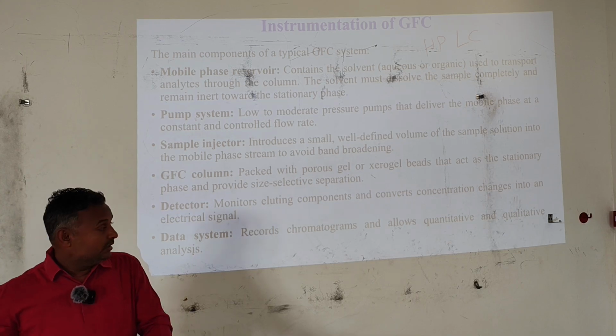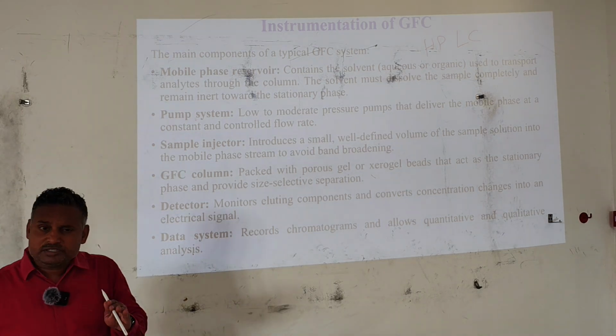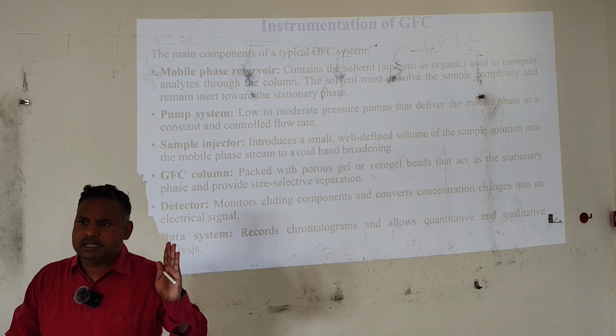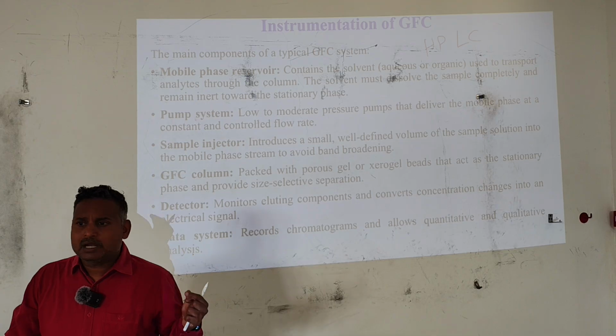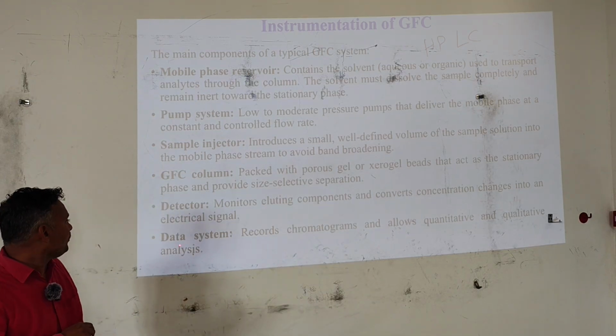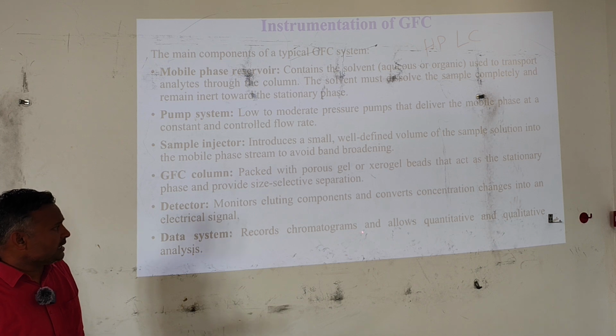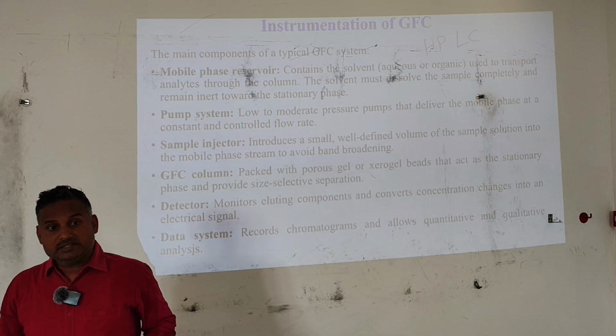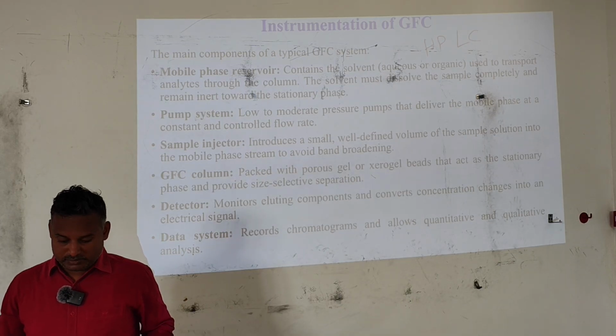That is how it will detect. We have of course different detectors. In this case, similar to all other HPLC techniques, we are also having different detectors here for this technique. The data system records chromatograms and allows quantitative and qualitative analysis. Quantitative and qualitative analysis we can perform.